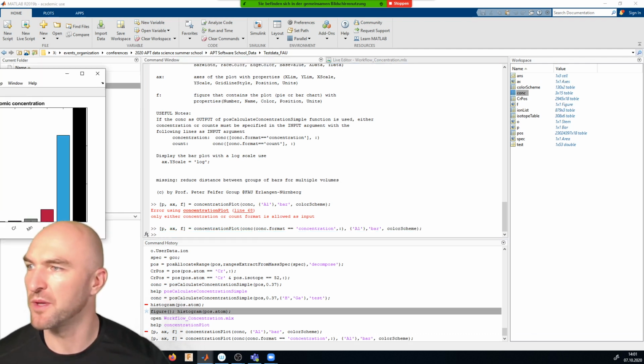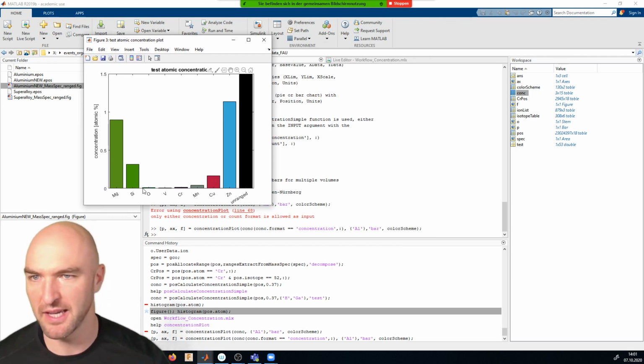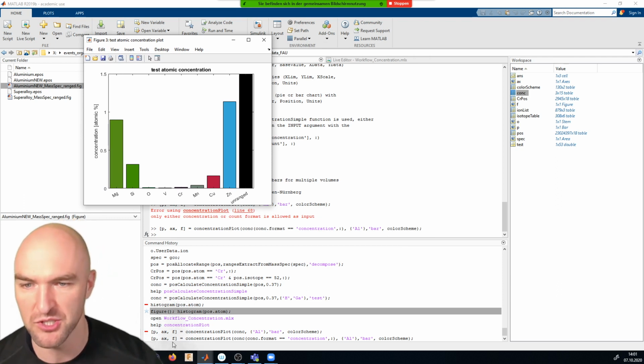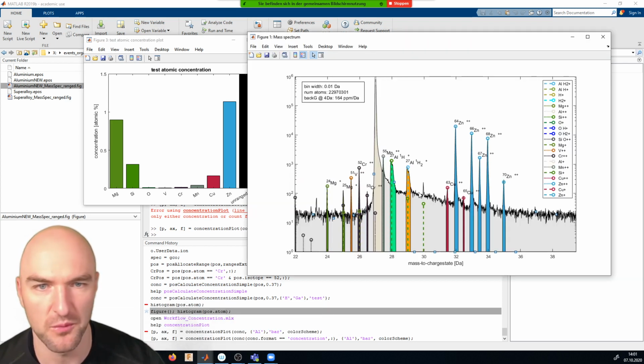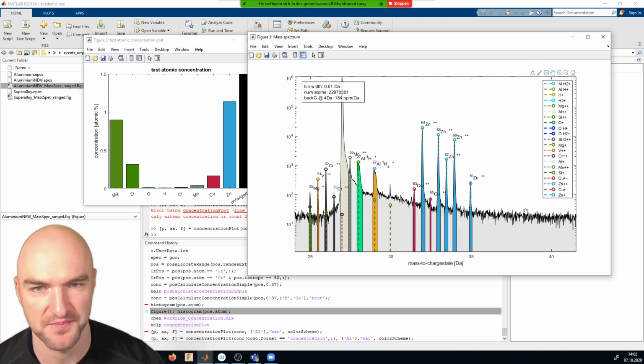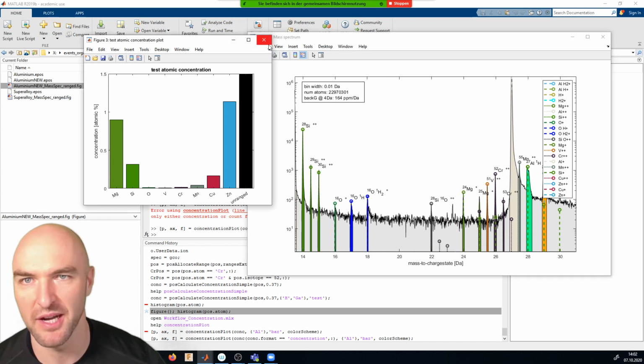And now what we get is a very nice plot where we can see, okay, we've got our magnesium, our silicon, our copper, our zinc, and we have quite a lot of unranged that we have in that one range that we call unranged. I have to have a look again where that one is. And we have a very large bar showing us all the unranged events.